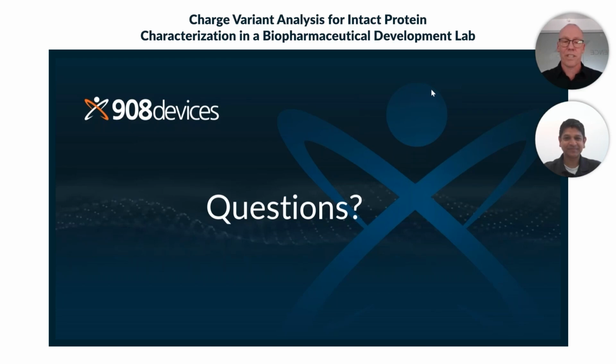And we saw this correlation clearly to the DMSO level, and that told us, well, it is related to something in the DMSO, and we were just very happy to find a variant that had virtually no DMSO. I hope it's reproducible.